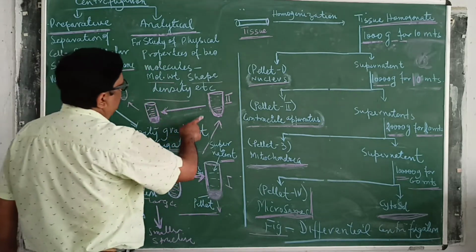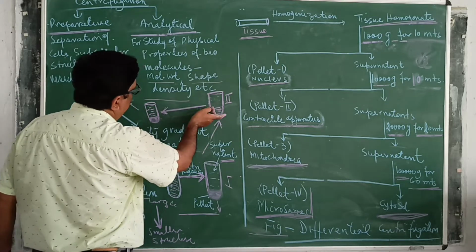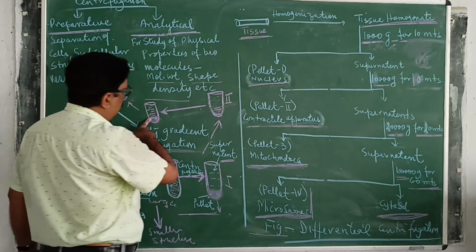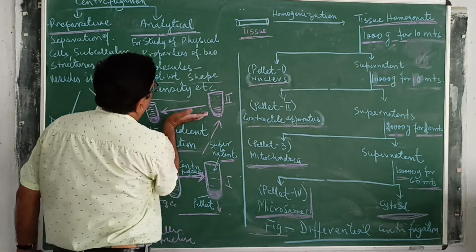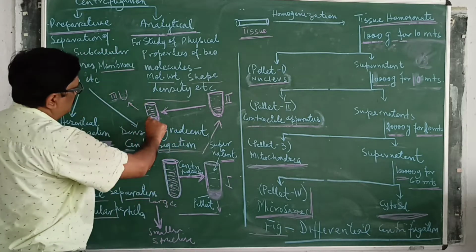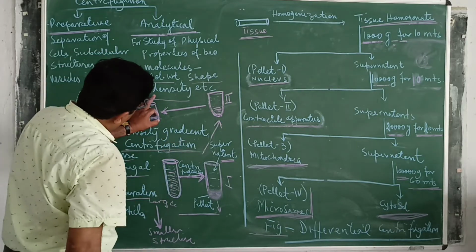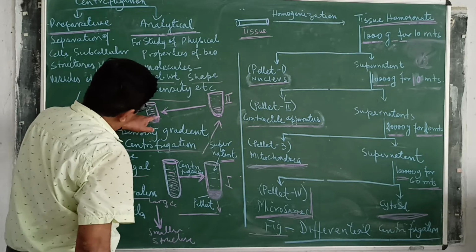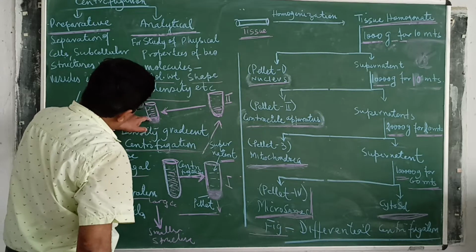In the next step, this supernatant is again subjected to centrifugation with a higher centrifugal field, resulting in separation of another component.